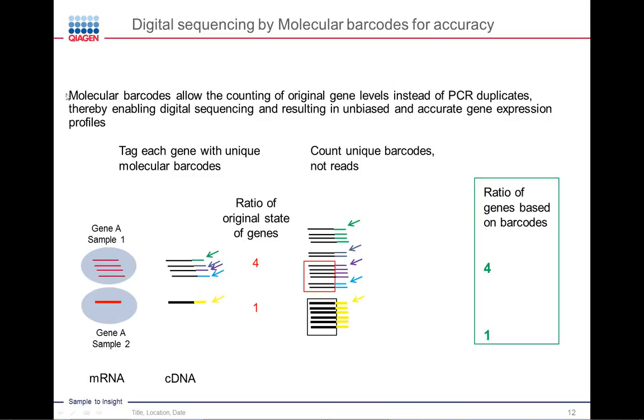Does the system work for bacterial RNA? We have not tested bacterial RNA, and the analysis pipelines that we have put together have been developed to map reads to human RNAs. So I don't think at this stage that we can use the RNA panels for bacterial RNA. The technology in theory should work. It's just something that we have not developed so far.